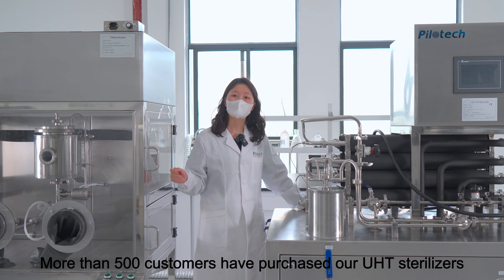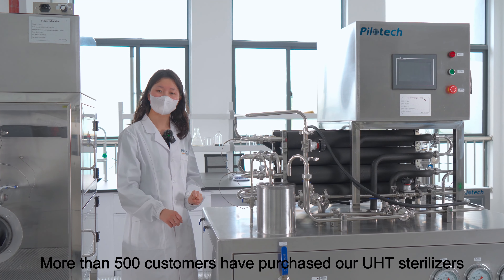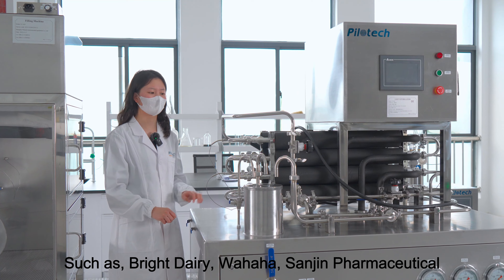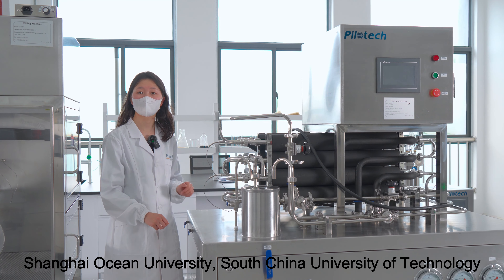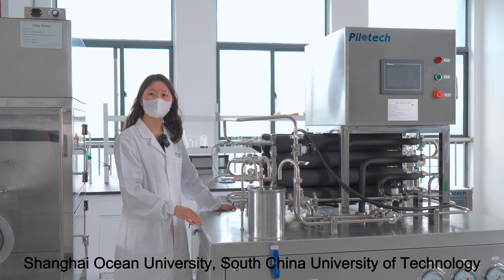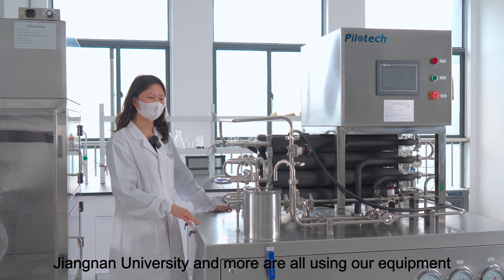More than 500 customers have purchased our UHT sterilizers, such as Bright Dairy, Wahaha, Sanjing Pharmaceuticals, Shanghai Ocean University, Zhejiang University, Jiangnan University, and more — all using our equipment.